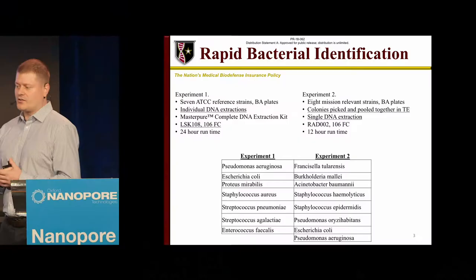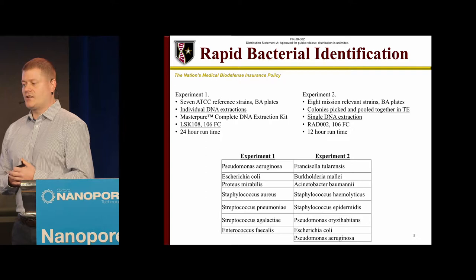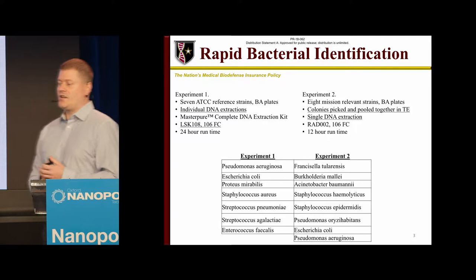We would prefer not to do fragmentation or PCR if we can help it, and what's the best and fastest DNA extraction? And then once you do that, how quickly can you get results and how good are they? So we did two experiments initially looking at rapid identification. In the first one, we took 7 ATCC reference bacterial isolates, grew them on plates, pulled the colonies off, did individual DNA extractions using the MasterPure complete DNA extraction kit, and pooled the DNA together at non-standard ratios, did a 1D ligation run for 24 hours on a 106 flow cell.